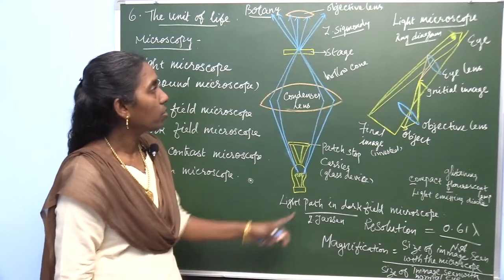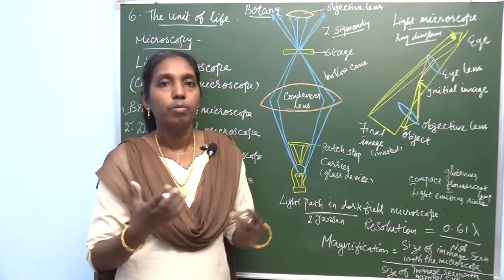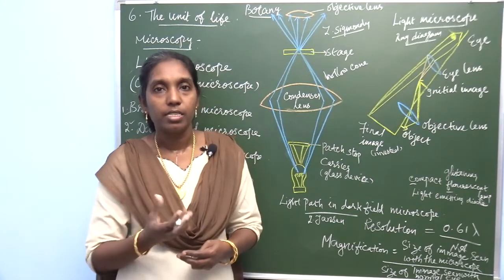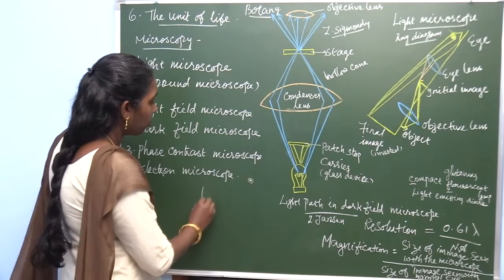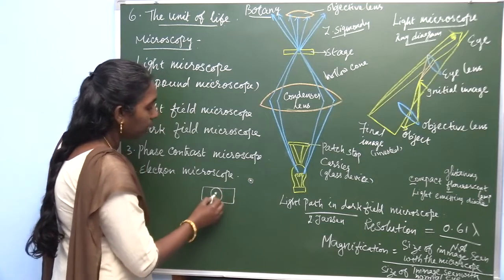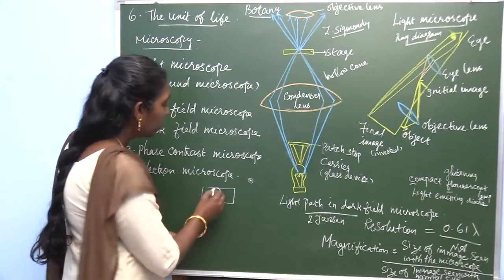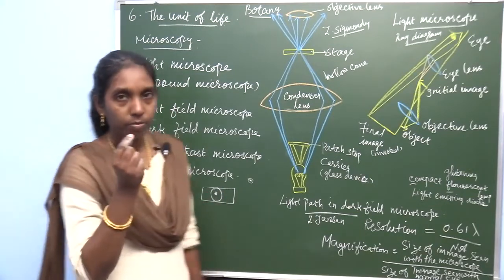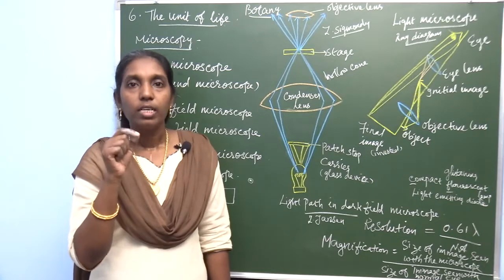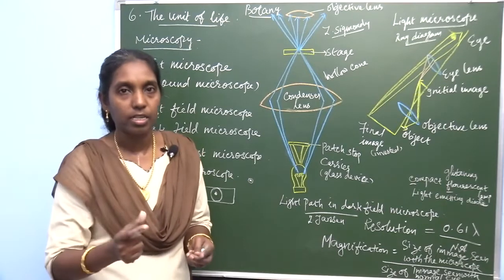This is the dark field microscope. This is the bright field microscope. Think of the normal microscope you used in the 10th standard. The slides are microscopic slides which contain a specimen mounted with a cover slip. This is the microscopic slide, and this is the object, a very small object. You may see a blue, violet or pink colored dot. You see only the dot, but what it is you cannot see with the naked eye when looking at the slide.